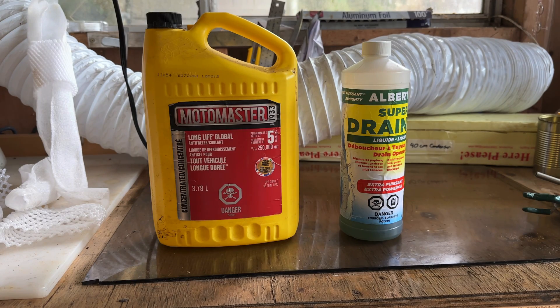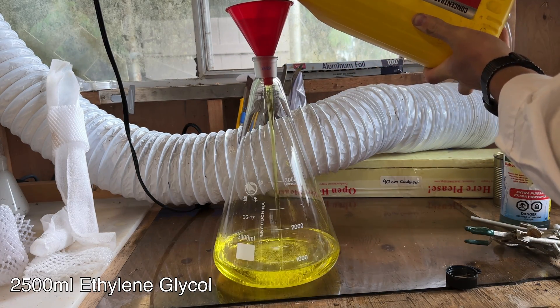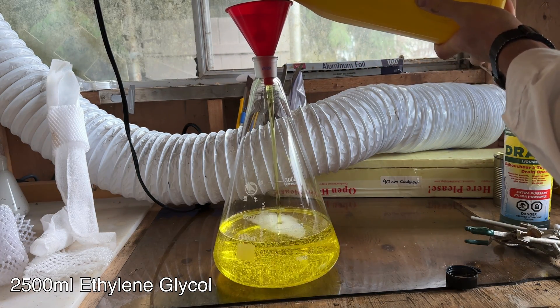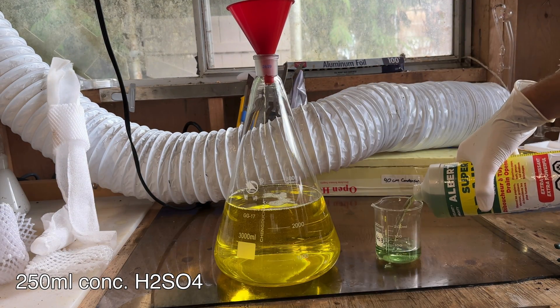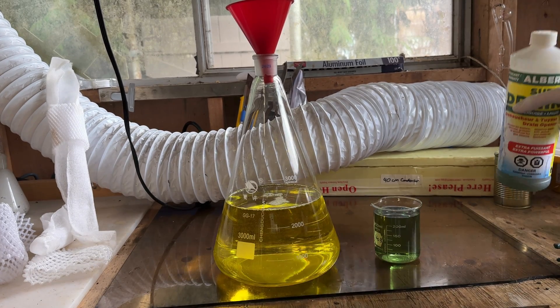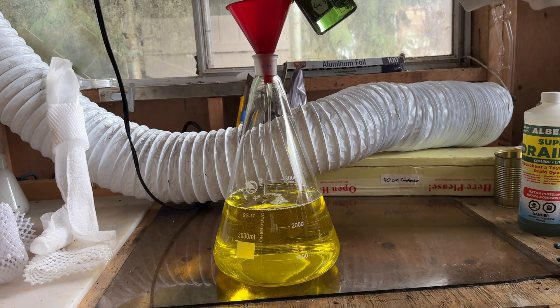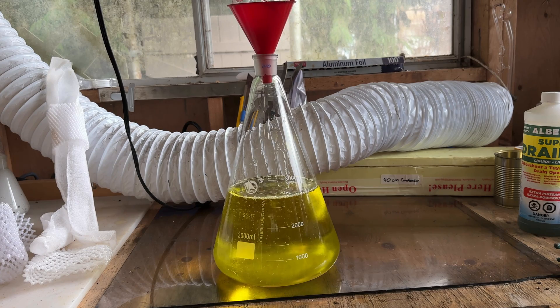To begin, a large jug of concentrated antifreeze was purchased from a hardware store. The ingredients listed should only be ethylene glycol. 2,500 milliliters of ethylene glycol was then added to a 3-liter Erlenmeyer flask, followed by 250 milliliters of concentrated sulfuric acid. This is slightly impure 93% sulfuric acid from drain cleaner; however, pure sulfuric acid distilled in a previous video could also be used.